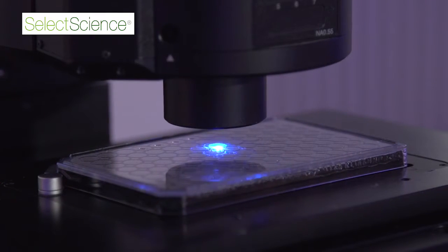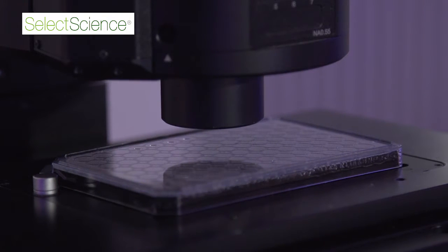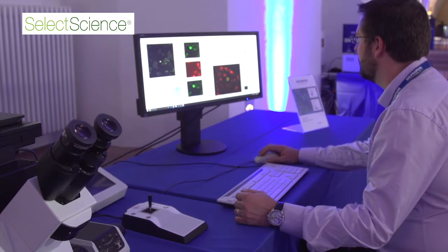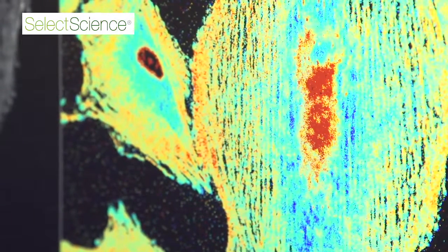The cell culture or the preparation of the fluorescent matter will be very, very important for us, because if you have a bad material, you won't be able to get nice imaging. So that's why it's important to get something fluorescent. And if you are doing live imaging, for example, in order to follow it, you need a nice fluorescence expression on your cells or on your tissue to get the most beautiful pictures, and then you can get information afterwards.